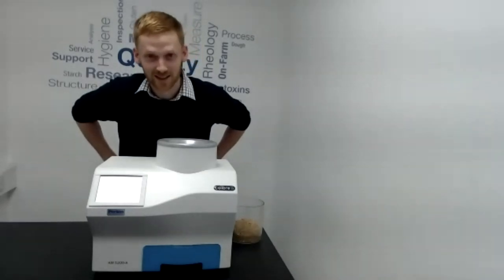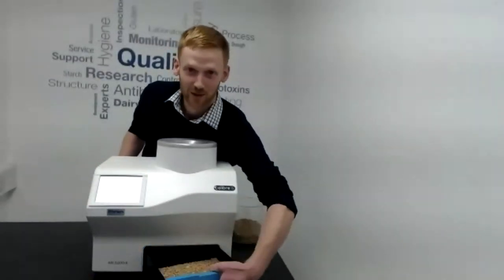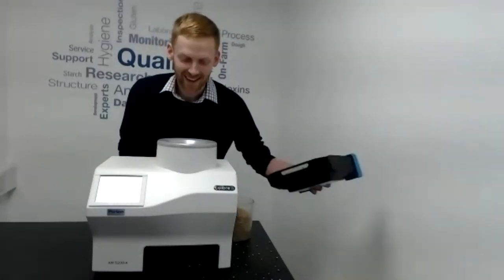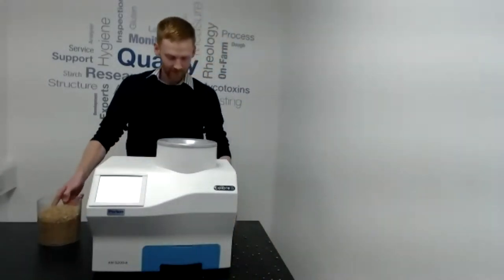After tipping the sample in, you'll hear the machine working and then the results are displayed on the screen. All you have to do is empty the sample drawer and then the machine is ready to go again. The simple operation of the 5200 is similar to many bench-top moisture meters you'd be familiar with.